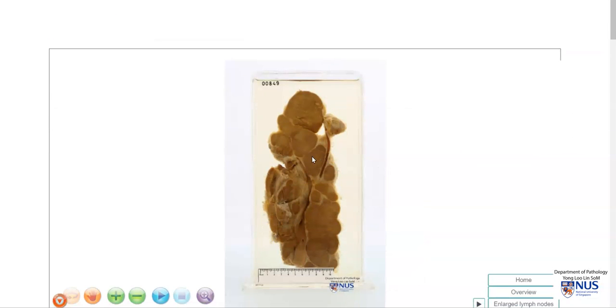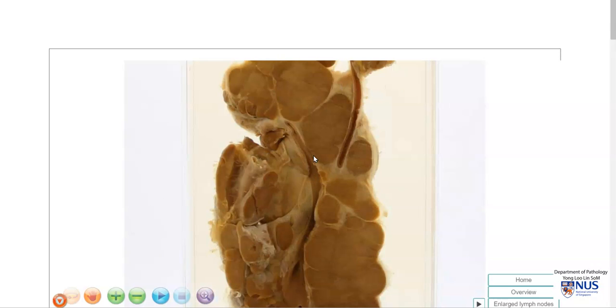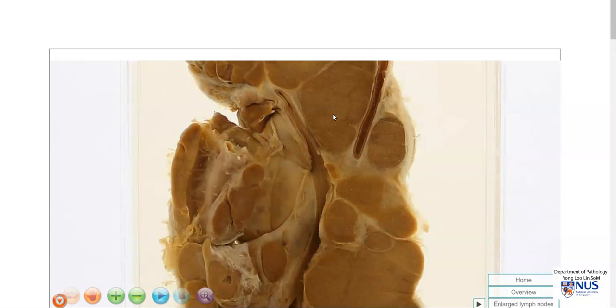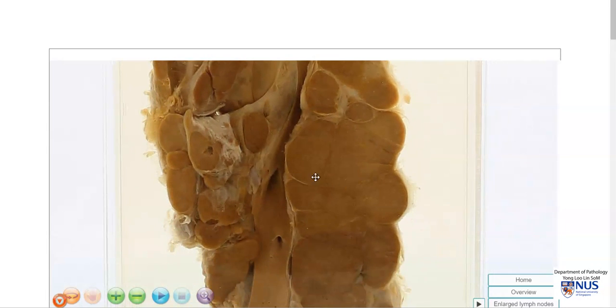In summary, this is an example of classic Hodgkin lymphoma causing marked enlargement of lymph nodes with a very fleshy cut surface and also matted lymph nodes. Thank you.